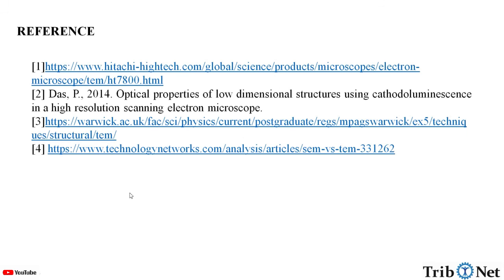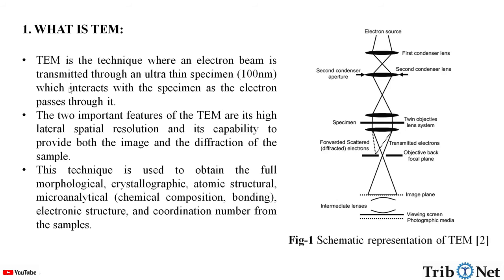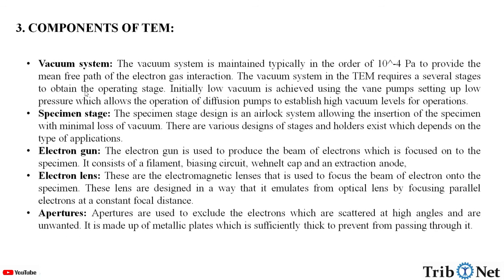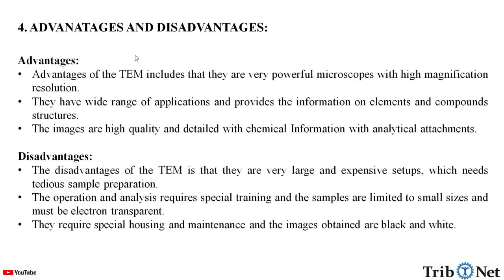In this video, we understood what a transmission electron microscope is, what the working principle of the transmission electron microscope is, what the components are, and what the disadvantages and advantages of TEM are.